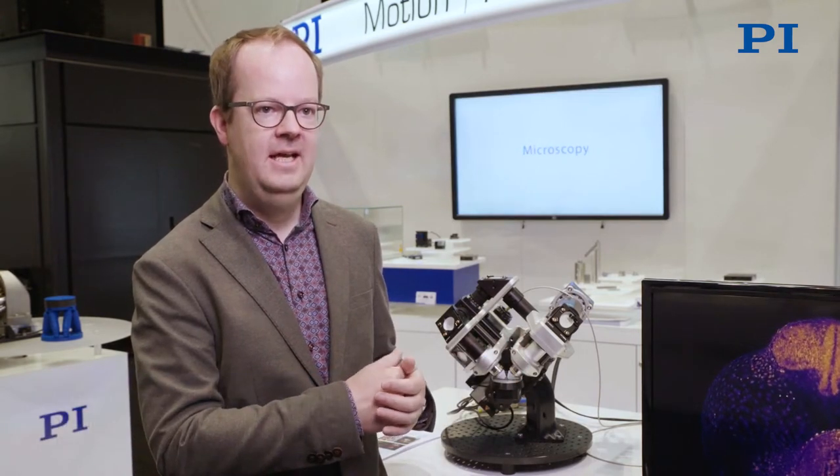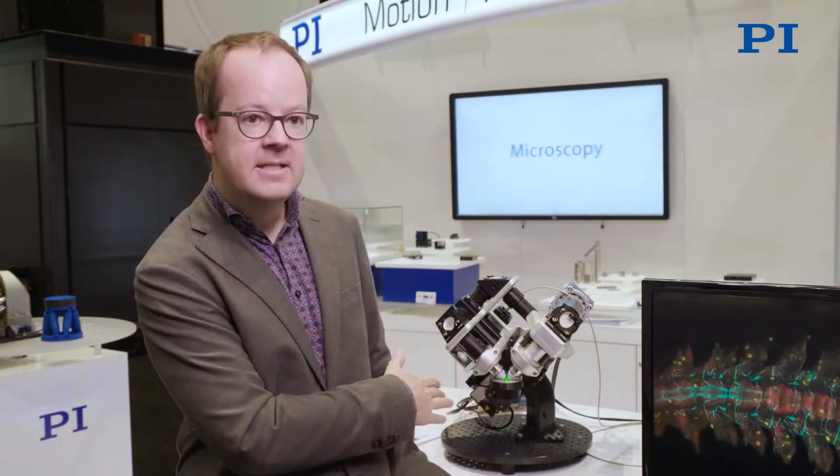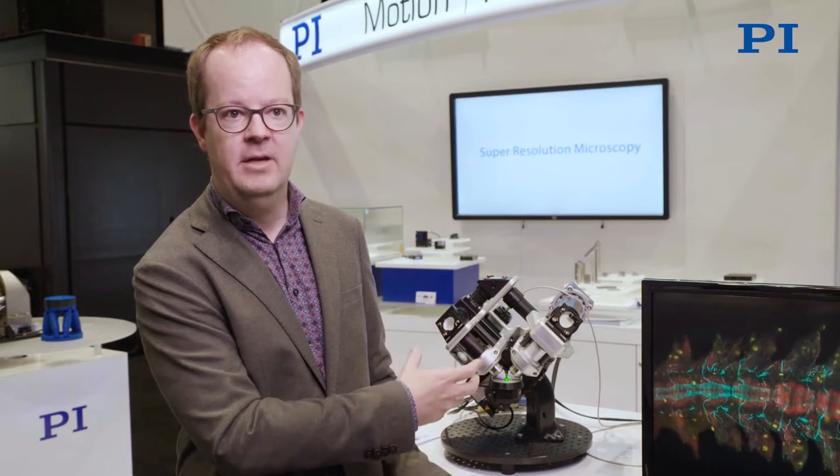Hi, my name is Jan Hüsken. I'm a scientist at the Morgridge Institute for Research in Madison. We're here at the PI booth in Chicago at the Society of Neuroscience conference, and we are showcasing the Flamingo instrument here, which uses PI stages to move the specimen in this high-resolution microscope.